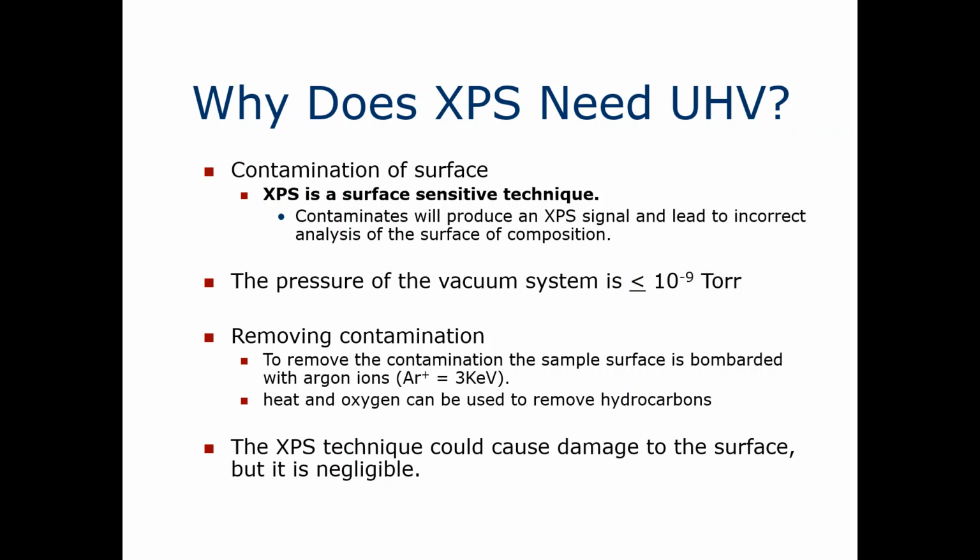So we cannot say that XPS is a surface destructive technique. XPS is safe. It's not destroying the sample to the extent where you can say that it's a destructive technique. So it is a safe technique, and the destruction caused by it is negligible.